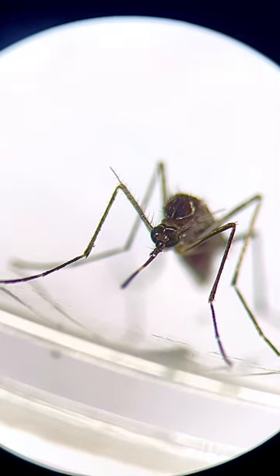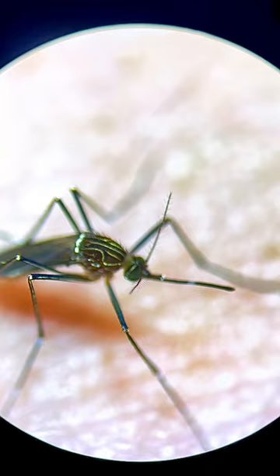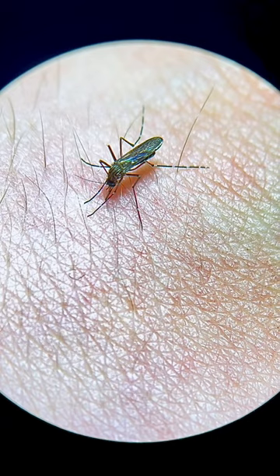This is a mosquito and I let it bite me on purpose. This is what a mosquito bite looks like under the microscope. Mosquitoes have a complex mouth — it is made up of many parts.